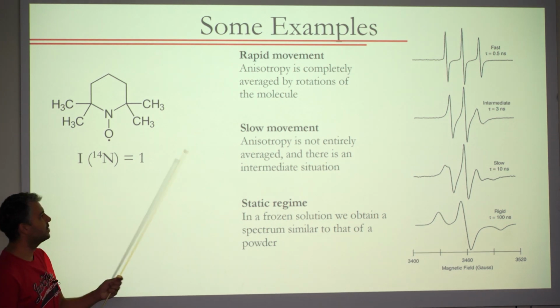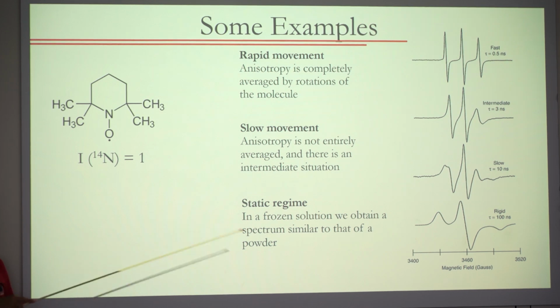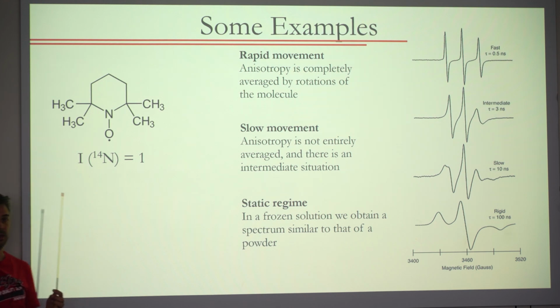The g values are not that different, but the A values are quite different, because the magnetic dipolar interaction that gives rise to the anisotropic part of the hyperfine splitting is intrinsically anisotropic. So it has, let's say, 10 megahertz in one direction and -5 and -5 on the others. So it's always there. You cannot avoid it. So when you freeze, you will see anisotropic hyperfine splittings.